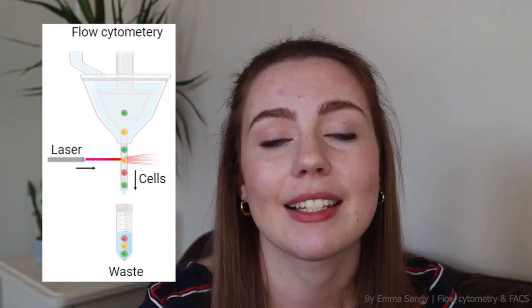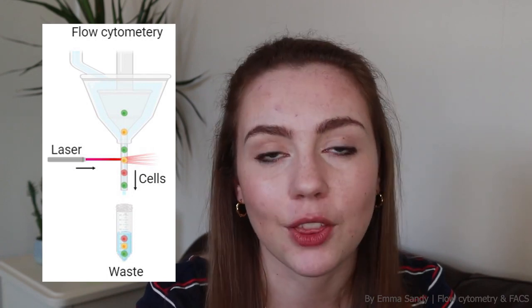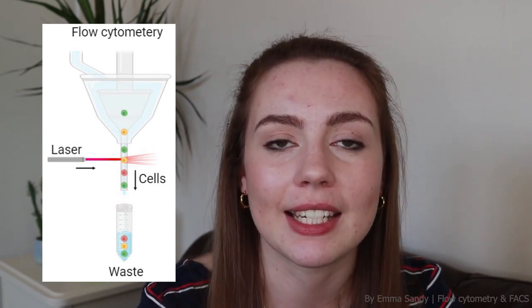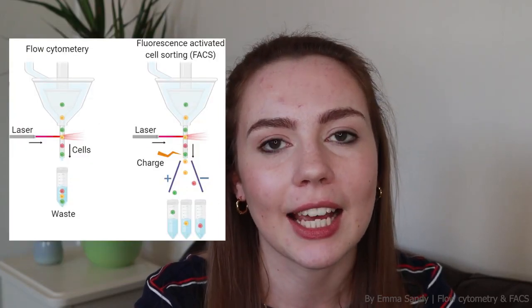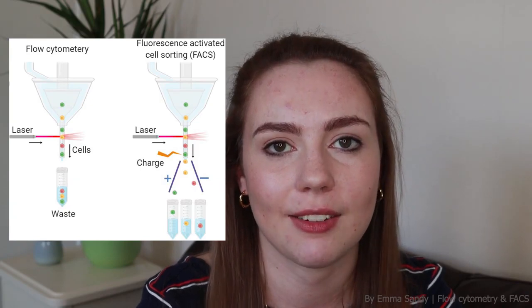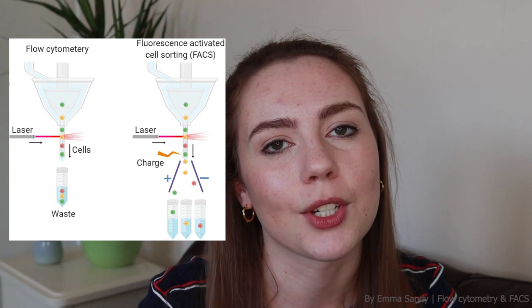In flow cytometry, these cells are analysed and we collect the data, but the cells themselves go into the waste and they're not collected. The only output is the data. The difference in FACS is we can analyse and then we can collect for these specific cells of interest. And people frequently confuse the two, so it's not technically FACS unless you are sorting for a cell population. So that's great, but if we're collecting data on every individual cell, what on earth do you do with it?